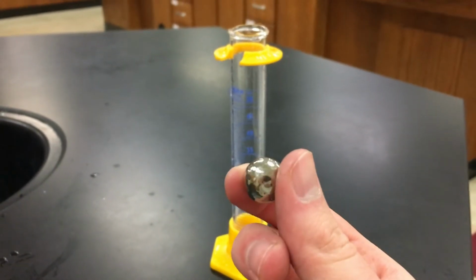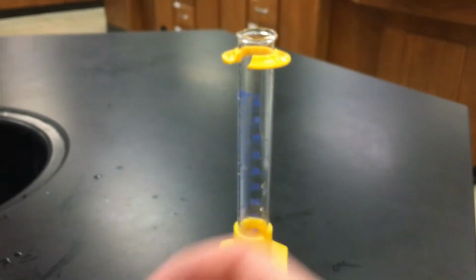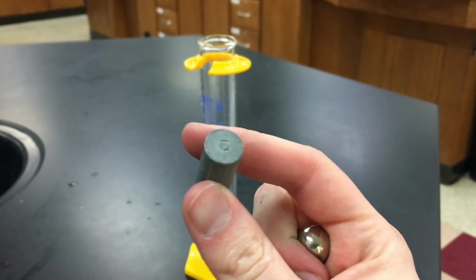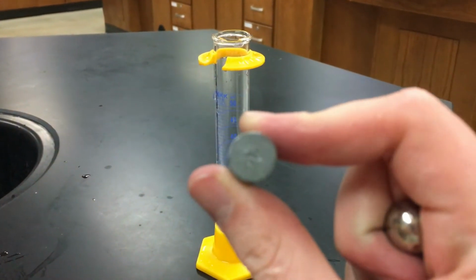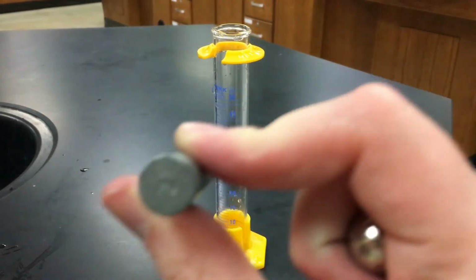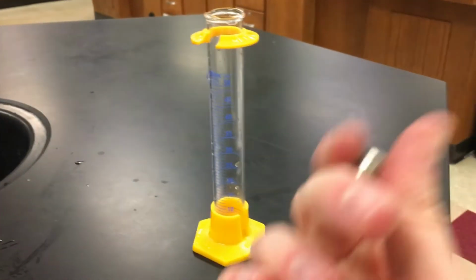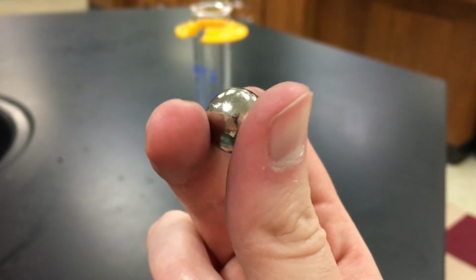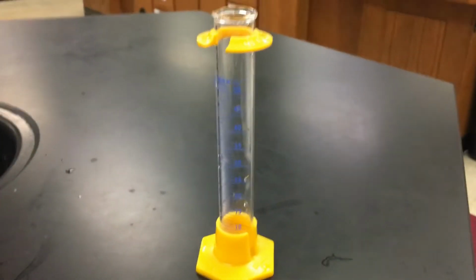Now there is an equation for the volume of a sphere that I could try and use. And the metal samples we're going to use in the lab are cylinders. Also, there is an equation for that volume, but a lot of these have imperfections. They have markings and divots, rounded edges. And in this case, the nickel ball is not a perfect sphere. You can see there are some flat dented edges, just how I got it to stay on the mass balance so nicely.